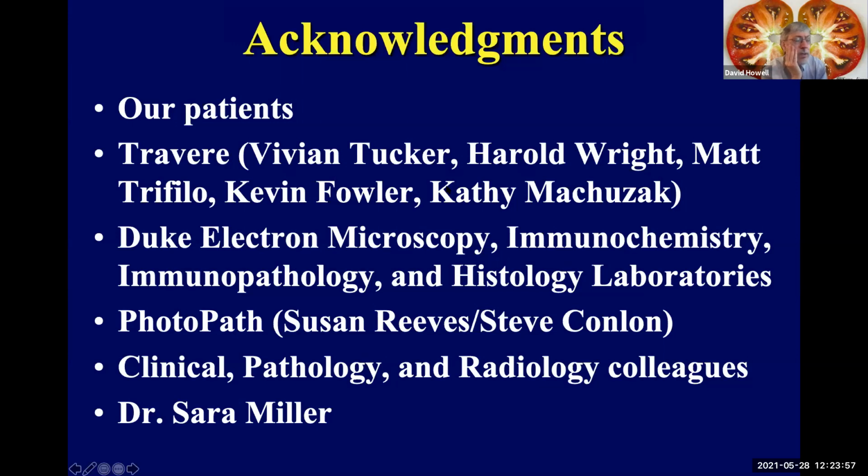Karnovsky's fixative is sometimes used. It's a mixture of formalin and glutaraldehyde, and it supposedly gives good results. You can take a piece of tissue and fix it in that and use it equally well for EM or light microscopy paraffin sections. And I would say parenthetically that the electron microscopy cognoscenti will tell you that glutaraldehyde is the best fixative for electron microscopy. But actually formalin is a pretty good fixative for it as well.